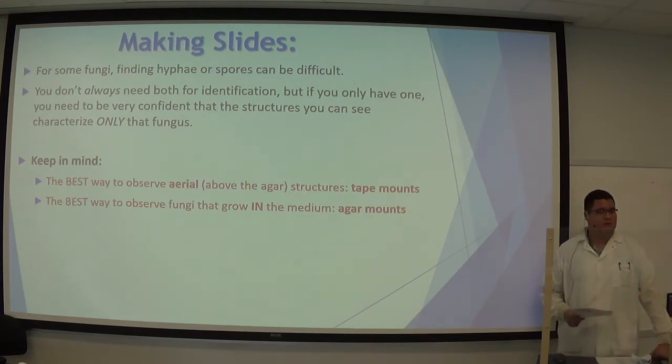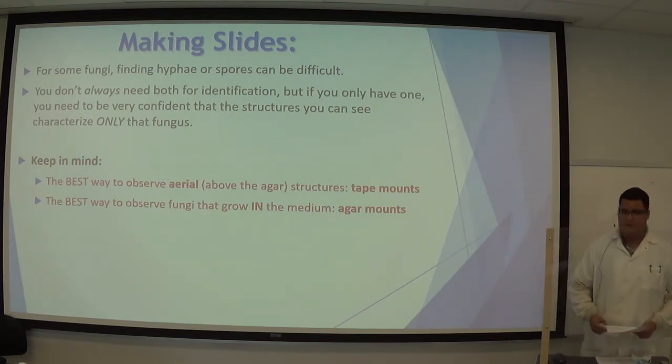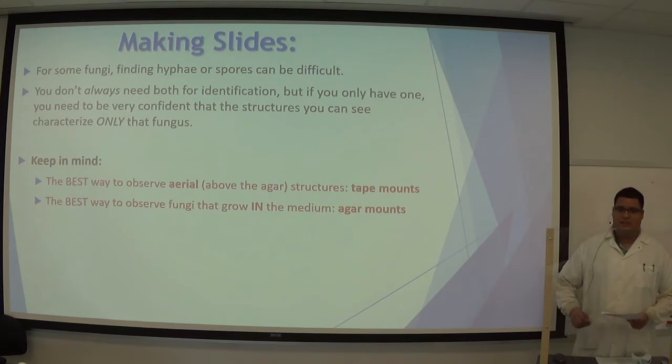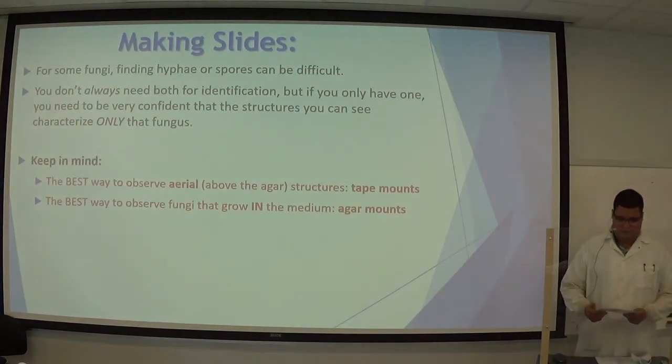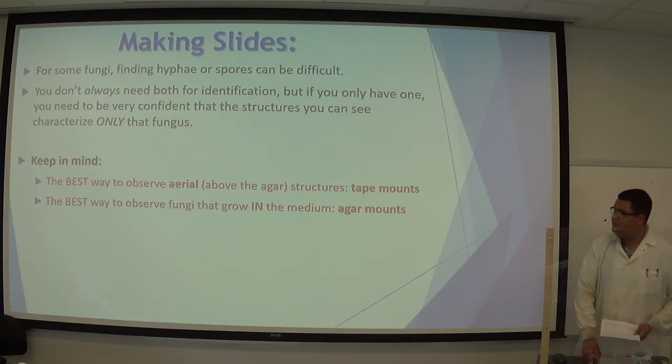As you recall, your project for those of you here in person is to identify the fungi growing on your plates, and we're going to do that by looking at the mycelia, specifically the hyphae, as well as the spores. So I'm going to show you today how to make slides to observe the structures of the fungi and how to identify certain features that will help you key out the fungi. We're going to be making tape mounts and agar mounts.